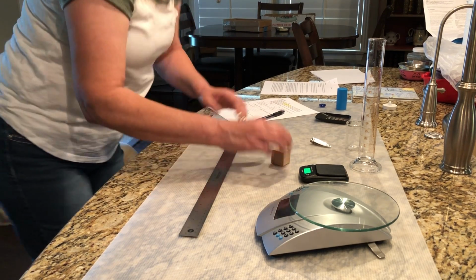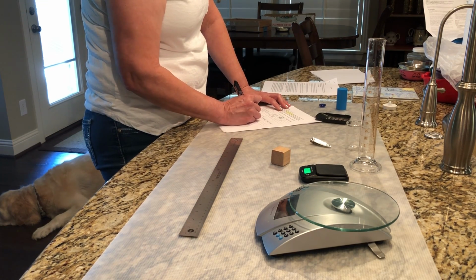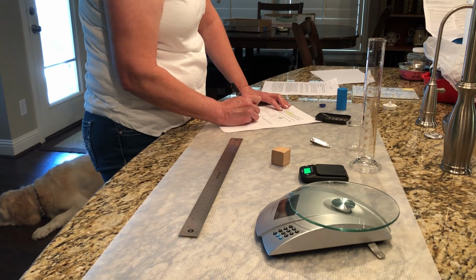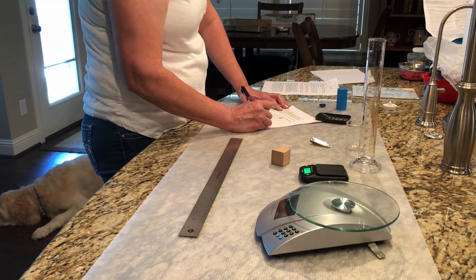It's coming out the same in all directions. So 2.95 for all three, for length, width, and height. The estimated digit would be the 5. Significant digits would be 3.